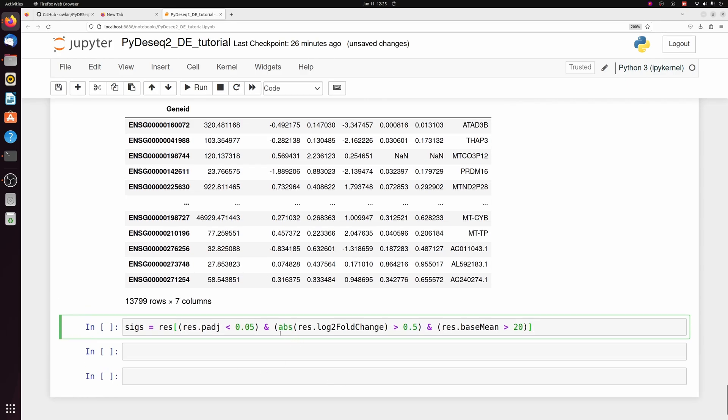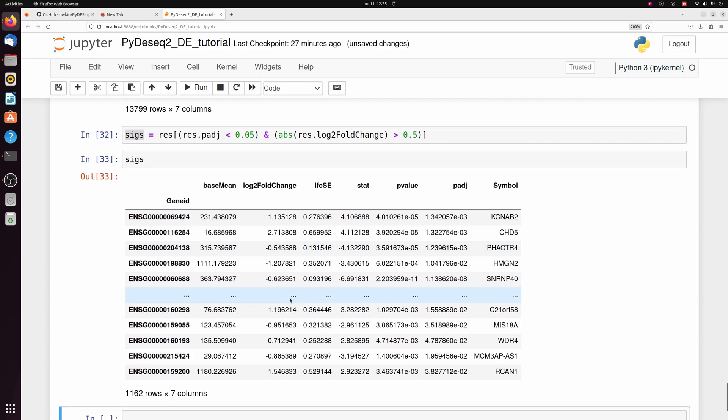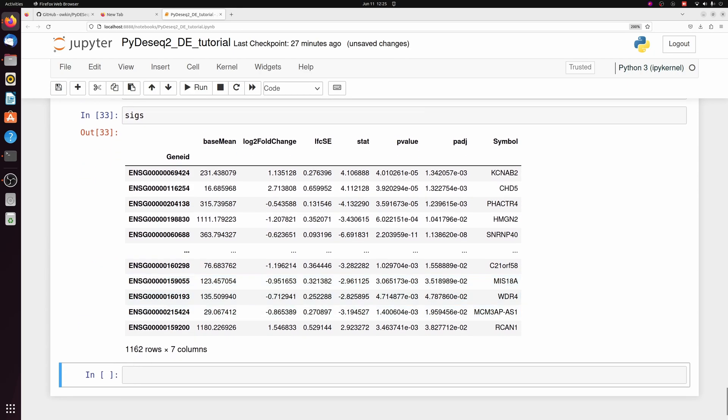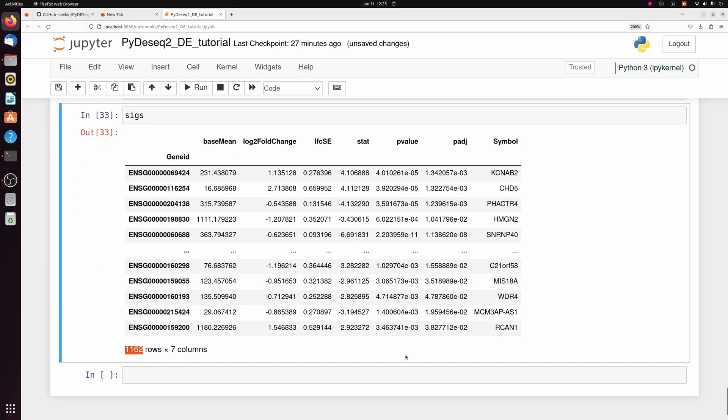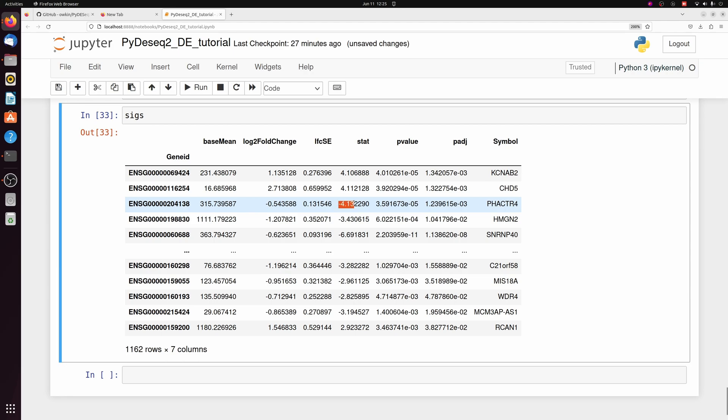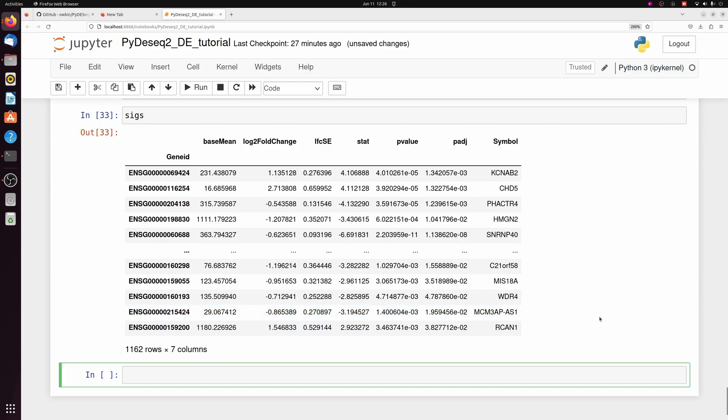If you wanted to find your differentially expressed genes that are actually significant, you can filter this further. So p-adjusted value less than 0.05, and I like to do an absolute value log2 fold change filter as well. I want genes that actually changed at least 0.5 log fold. So if we look at SIGs, now we have 1100 differentially expressed genes. And you can filter those up or down based on the stat positive or negative value or the log fold change positive or negative value. So this is kind of the bare bones required workflow to get your differentially expressed genes.